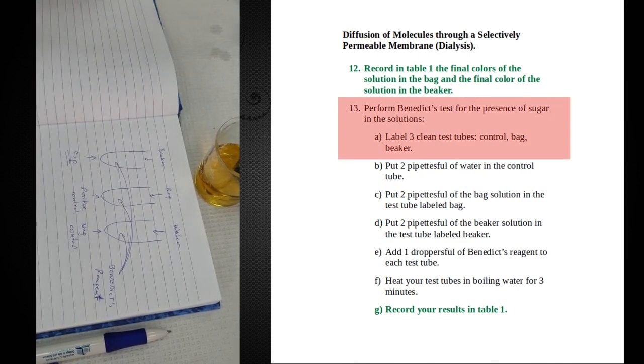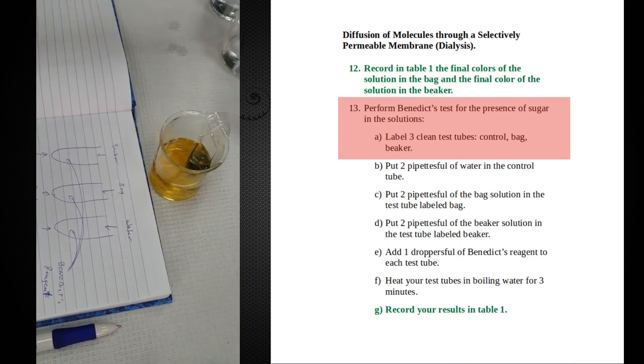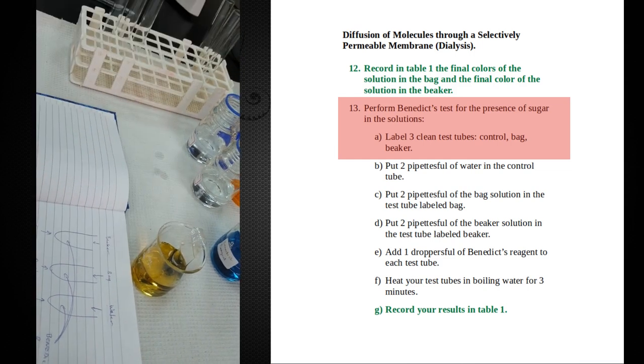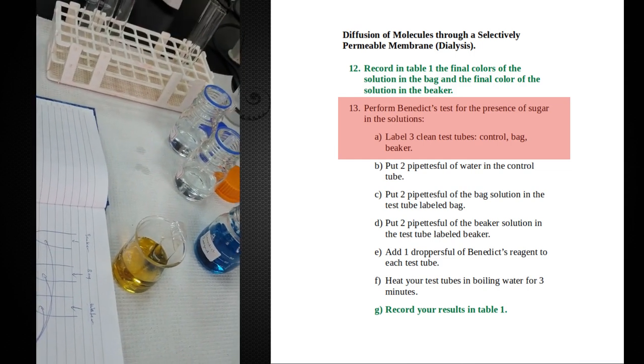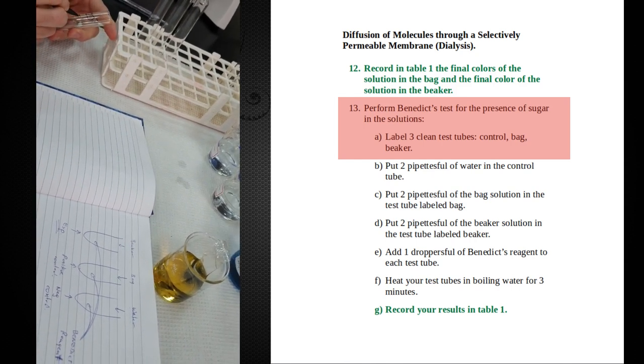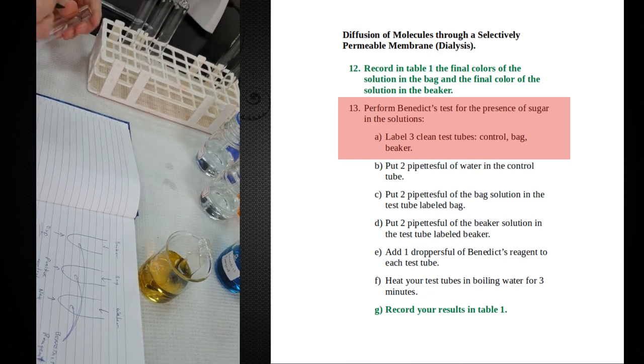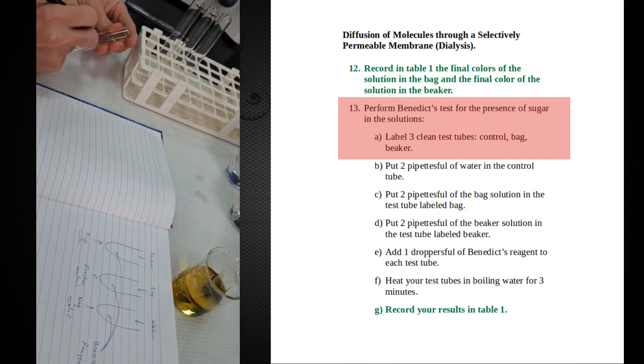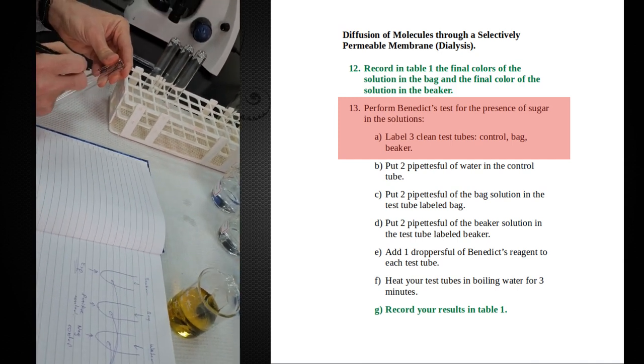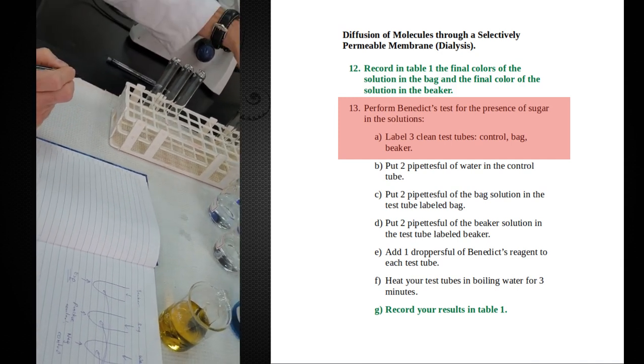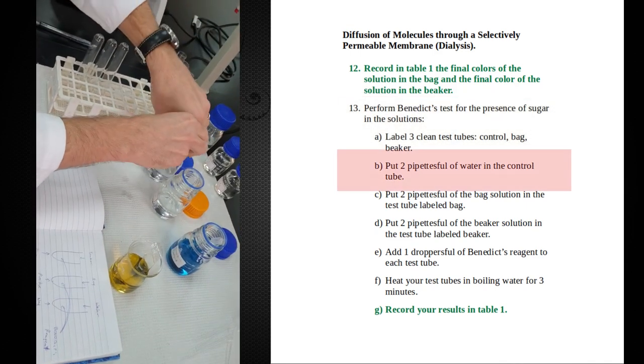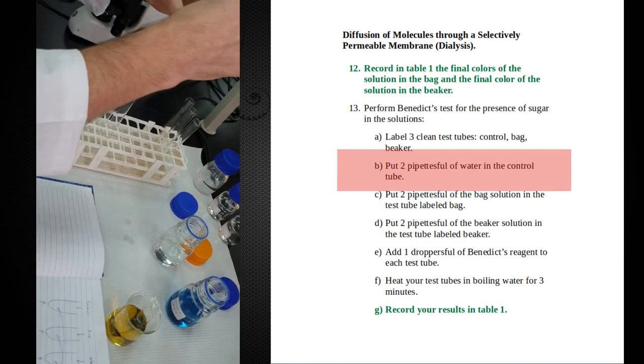So let's set this up. We need three test tubes. Tube one will be our experimental. Two will be my positive control. And three will be my negative control. So my negative control.